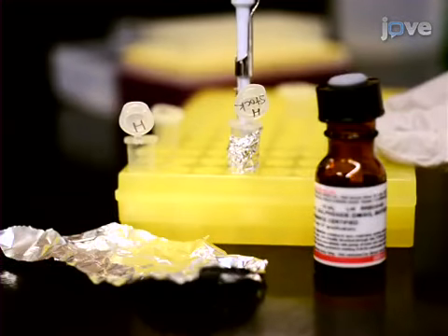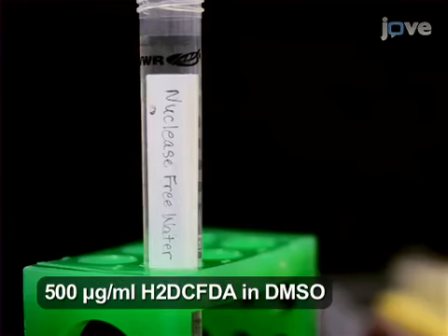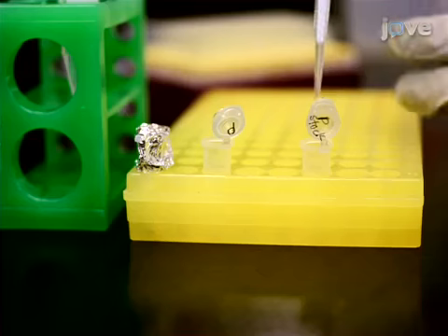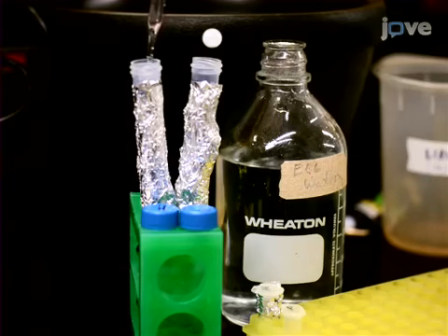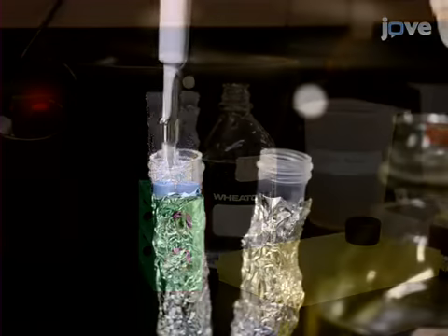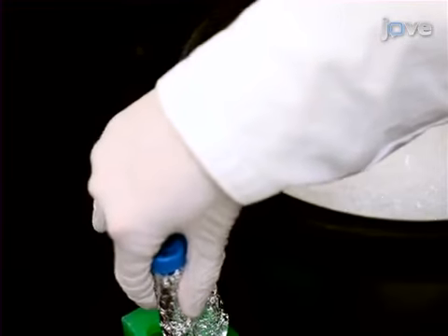On the day of the experiment, make a reduced fluorescein working solution in a foil-wrapped 1.7 milliliter microcentrifuge tube. Also prepare a working solution of 20 micrograms per milliliter PMA final concentration. Then make 5 milliliters of each dosing solution in 15 milliliter conical tubes as described in the accompanying text. Keep the dosing solutions on ice.